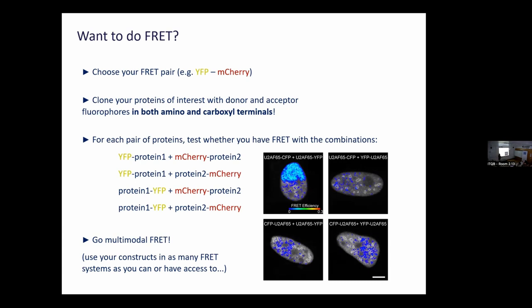If we put the fluorophore there, they may not interact, sure. But maybe they still do. Maybe the interaction domain is more in the middle. Maybe they bind like this. This is the N-terminus, this is the C-terminus. And if they are in the N-terminus, they are 5 nanometers apart. They're very, very close. Maybe in the C-terminus, in the same protein, they are probably 12 or 15 nanometers apart. You no longer detect an interaction. So absence of FRET does not mean that you do not have an interaction. They might be glued together, but the fluorophores themselves are further than 10 nanometers apart.